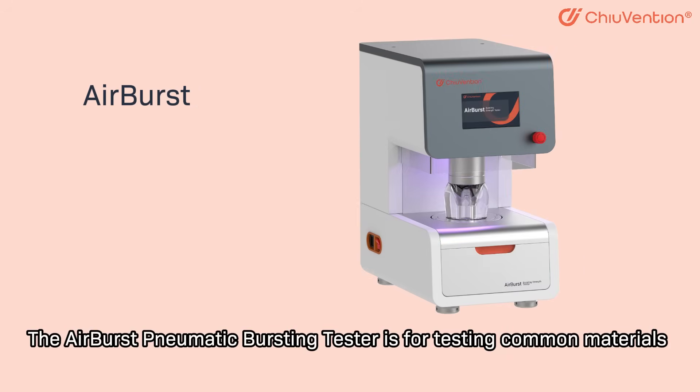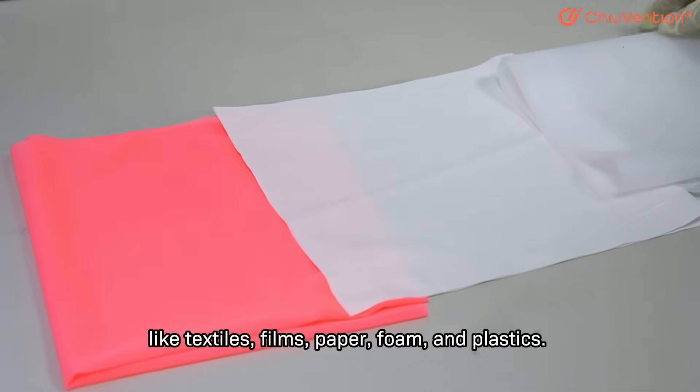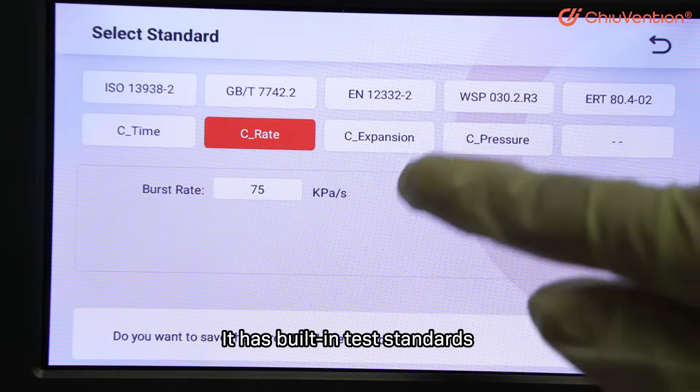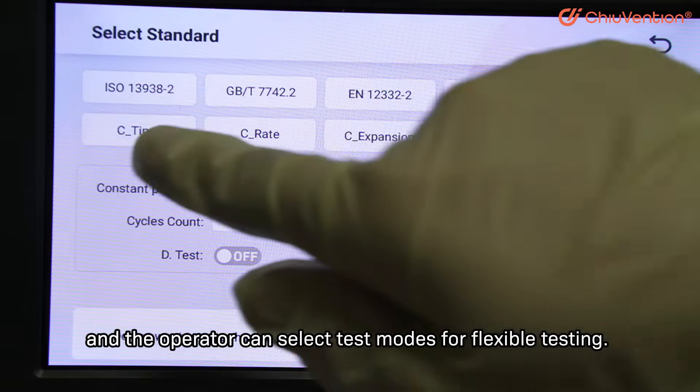The Airburst Pneumatic Tester is for testing common materials like textiles, films, paper, foam, and plastics. The Airburst can realize one-click testing. It has built-in test standards and the operator can select test modes for flexible testing.